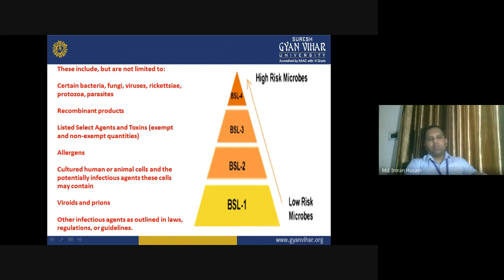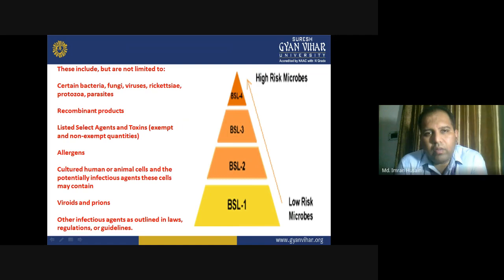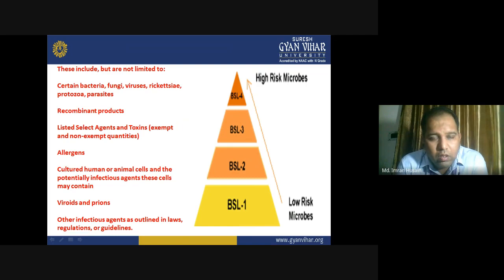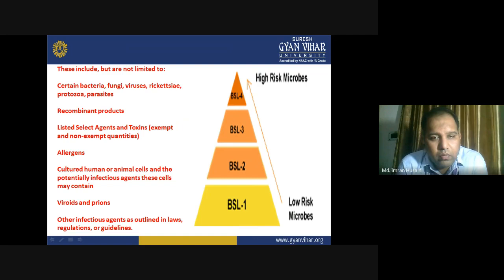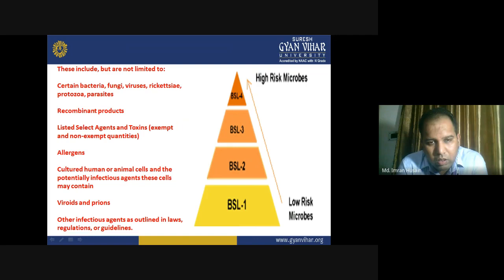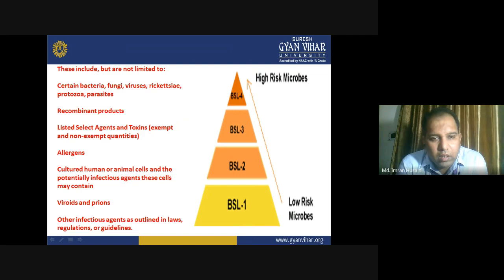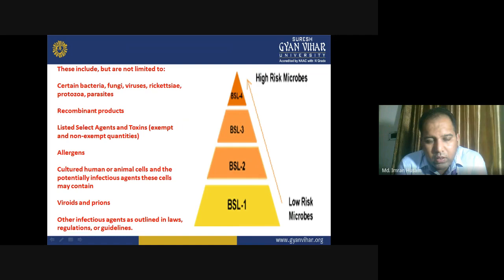These include, but are not limited to, certain bacteria, fungi, viruses, rickettsia, protozoa, recombinant products, listed select agents and toxins, exempted and non-exempted quantities, allergens, cultured human or animal cells and the potential infectious agents these cells contain, viroids and prions, and other infectious agents as outlined in law, regulation, or guidelines.